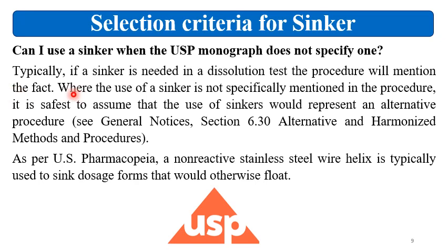Now where the use of a sinker is not specifically mentioned in the procedure, it is safest to assume that the use of a sinker would represent an alternative procedure. See General Notices section 6.30, alternative and harmonized methods and procedures.